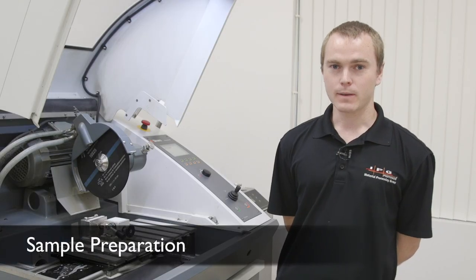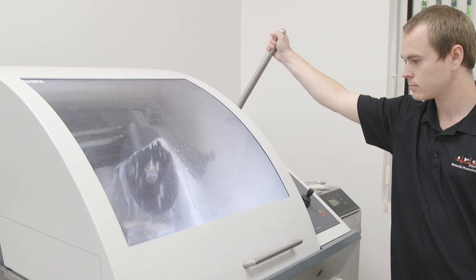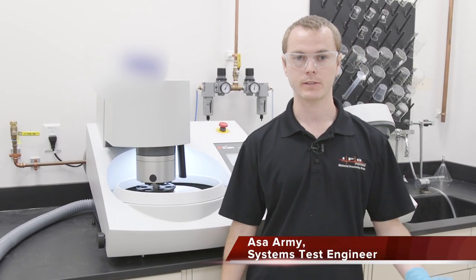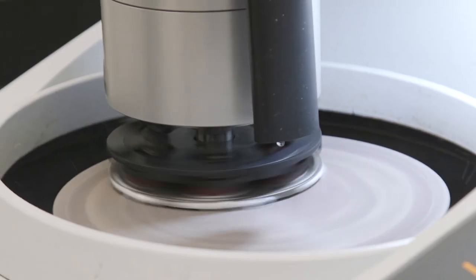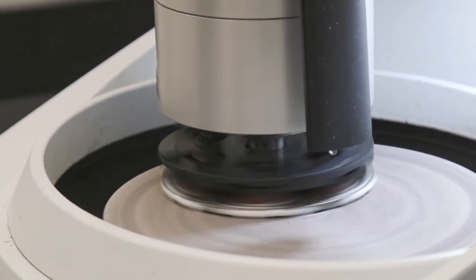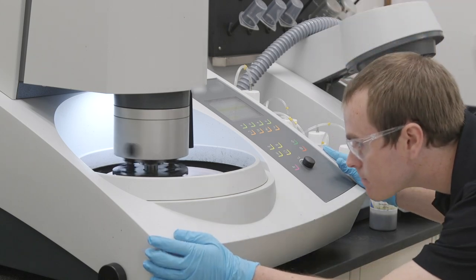Here we are in the sample preparation area where we are using a cut-off saw to dice up welding and cutting samples for mounting, polishing, grinding, and then inspection. After we dice the samples, we mount them in a hot press, grind and polish to a mirror finish, and then move on to etching where we drop acid onto the metal to bring out the grain structure and can actually see the weld bead.